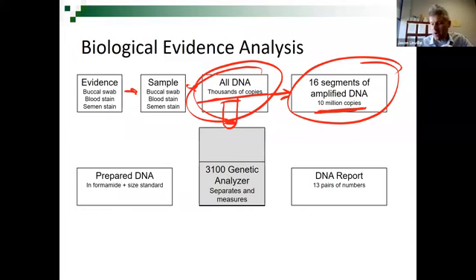In our tube that you just finished extracting, there were probably about 1,000 cells in the sample. And again, this really depends. There are probably a lot more cells in a buccal swab than in a blood stain. In some evidence samples, there might not be nearly as many as 1,000 cells, but we just want to think of it as thousands of copies of DNA.